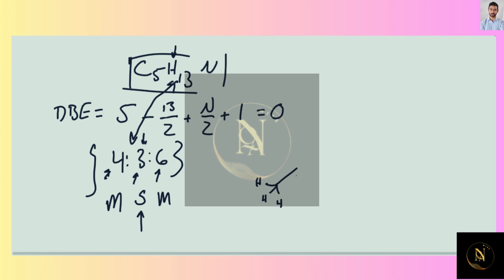One final thing worth considering is that we don't necessarily know if this is a carbon. It could be a nitrogen, so long as that nitrogen doesn't have hydrogens on it.